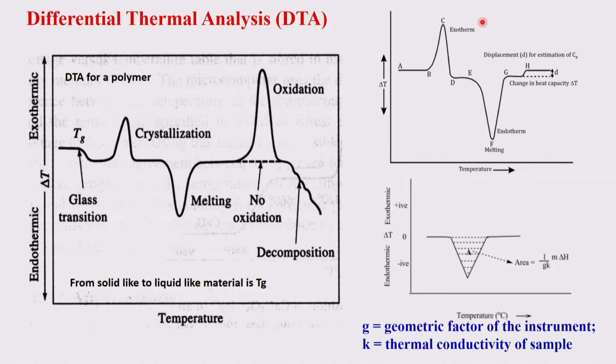So the same thing is shown here by one peak, another peak. If this is the positive side, delta is called exotherm; if it is the negative side, it is endotherm. So here exotherm, endotherm, and then this is the heat capacity change, not with a specific kind of thing. So going from one state to another state can also be measured in this, but that is most often measured by another technique, which I will show you later on.